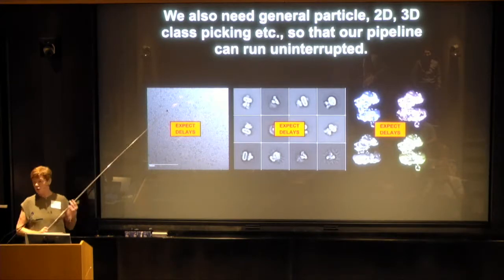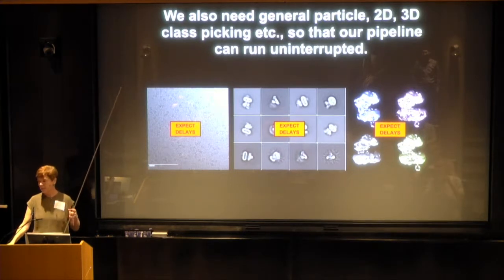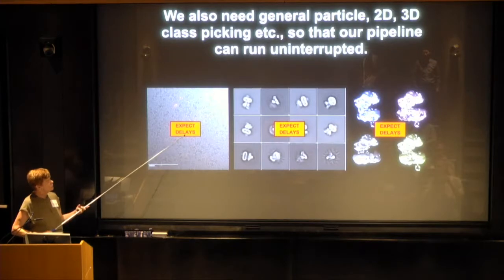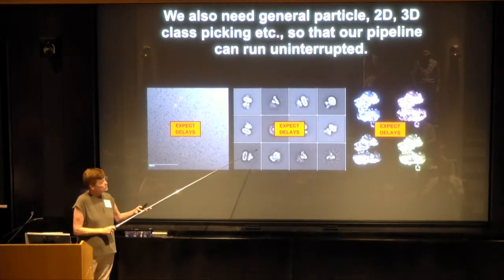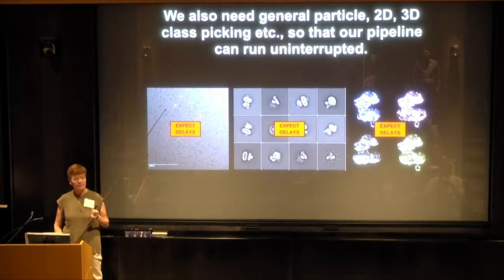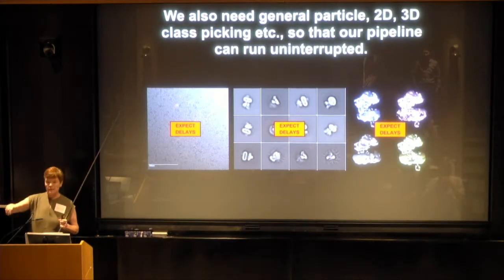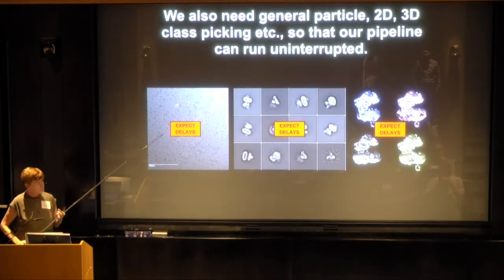We really want a generalized picker. After all these hundreds or maybe thousands of test samples out there right now where people have hand-picked and hand-curated, we should, I hope, be able to do this automatically. We should be able to automatically decide which ones we throw out, and we should be able to automatically decide how we proceed onto our 3D map. And if we could do all that, then as soon as we start collecting data, those 3D maps could start to be produced.